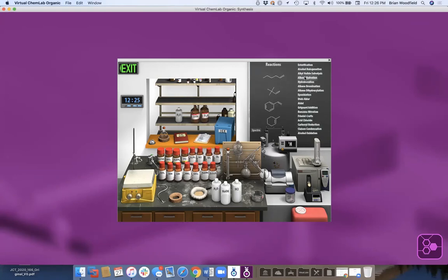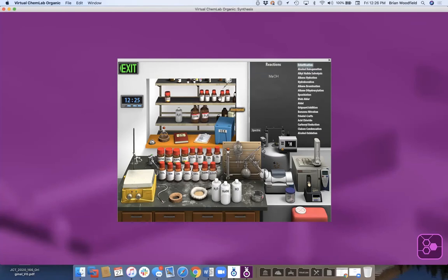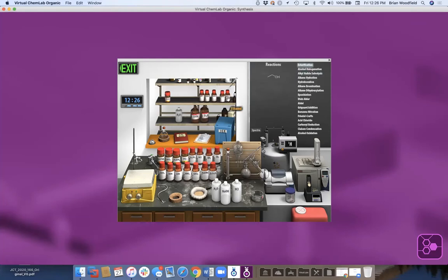You pick one of these named reactions, which define a set of starting materials. You don't have to do that specific reaction — these just pick a set of starting materials. If I pick esterification, it picks corresponding starting materials. Once I do that, I'm not restricted to esterification — I can pick zero, one, or two starting materials and a solvent and put them into a round-bottom flask in any order.